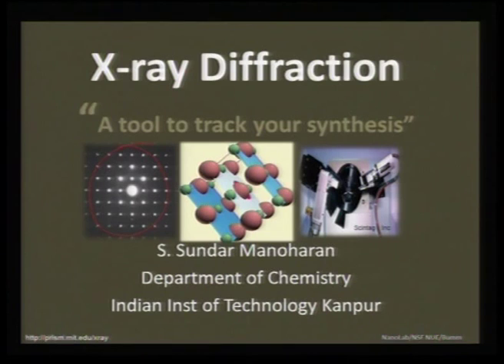As you can see here very clearly, this is nothing but an FCC pattern. Each spot in this diffraction pattern talks about a definite arrangement of atoms in a lattice, and that is what you see in this cartoon, that there are different planes which have a preferential occupation of a particular atom, and they are periodic in fashion. And how do we go about analyzing and getting different information about this atomic arrangement or order in a lattice?